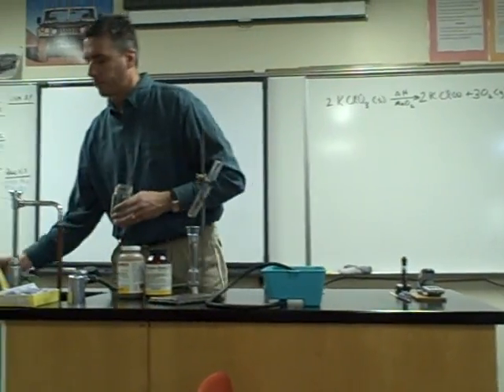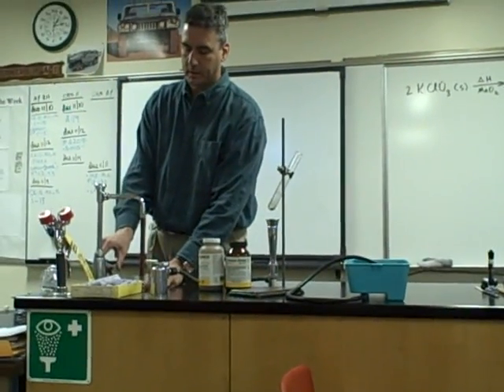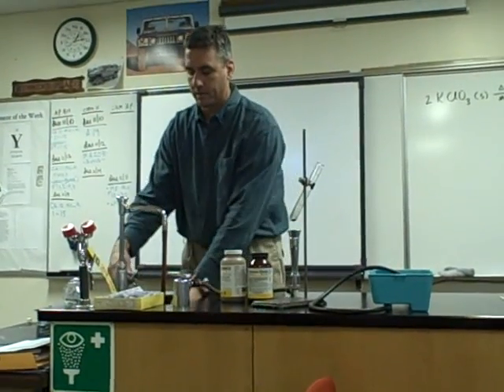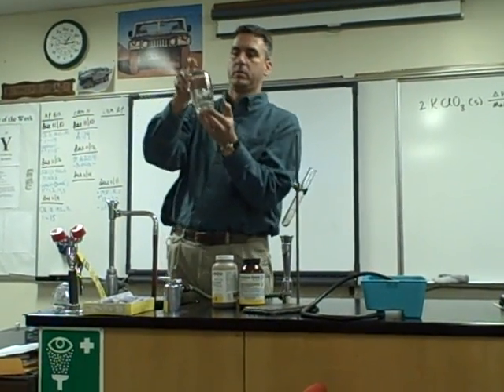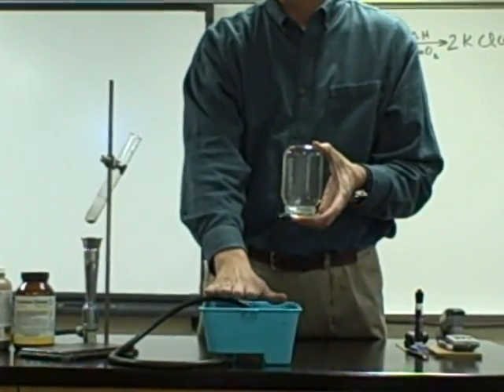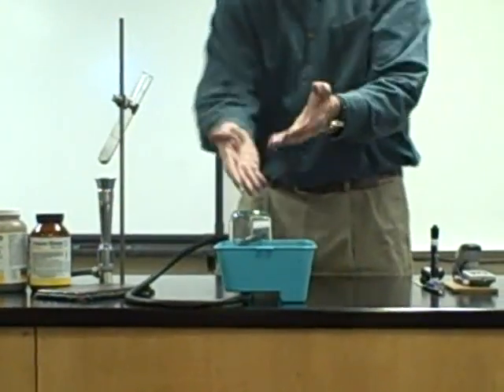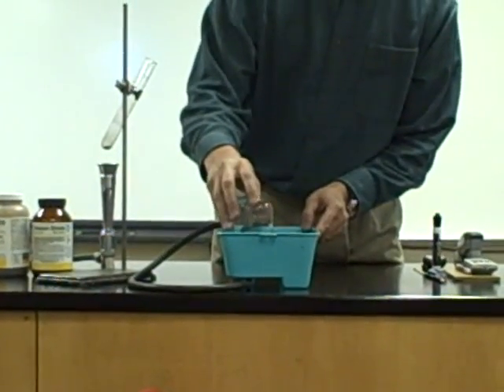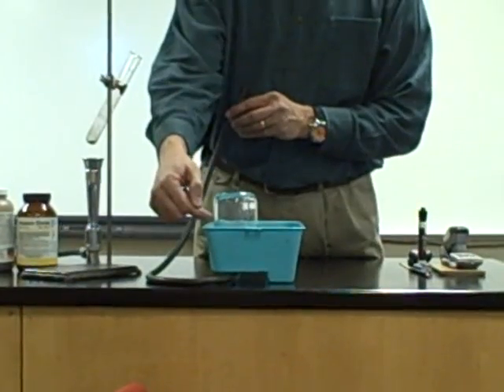This is sort of cute. What I do is fill this jar up with water — to the very tippy tippy top, back to the point where it's overflowing. Then I'll take this piece of glass and put it over top to make that air bubble out, and then turn it upside down. Pretend you don't see that air bubble there. So inside this jar we just have water. I'm gonna place this jar in this pneumatic trough — it has some water in the bottom. I'm gonna make the mouth of the jar go below the water level and pull that cover slip out. I'll position this jar over a tiny hole, and that hole is connected to this tube. So if I blew into this tube, the air from my breath would displace the water inside that jar.